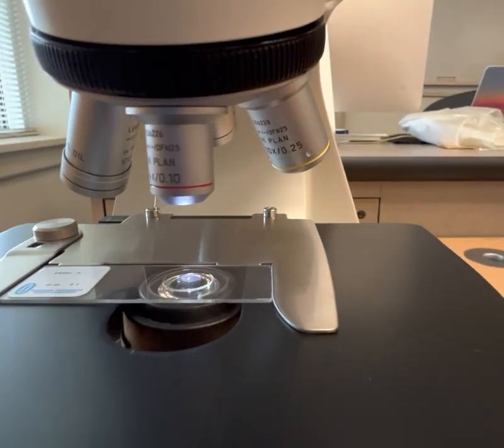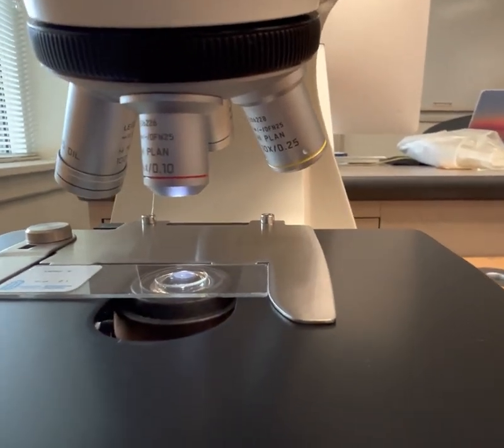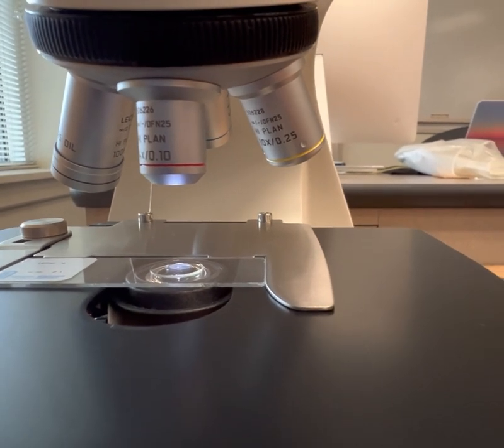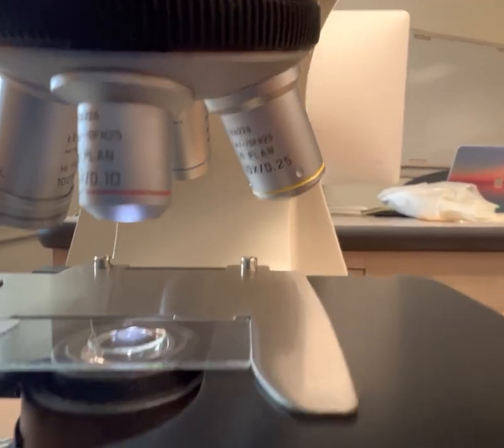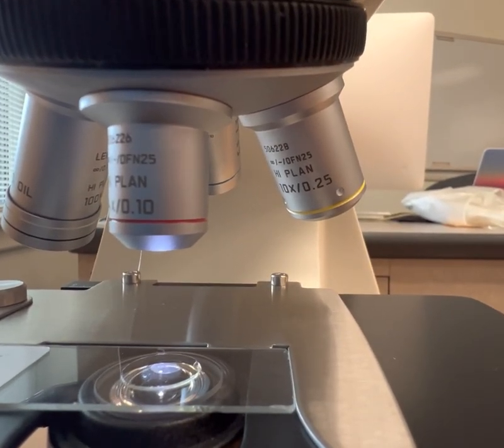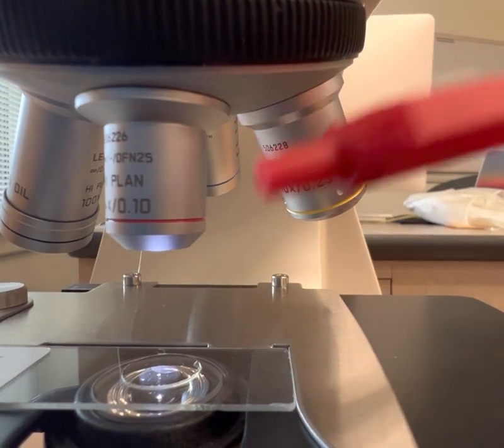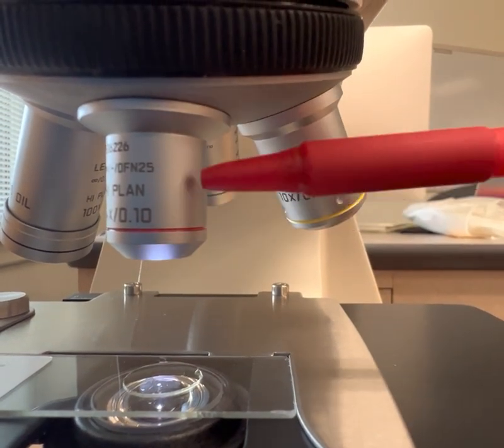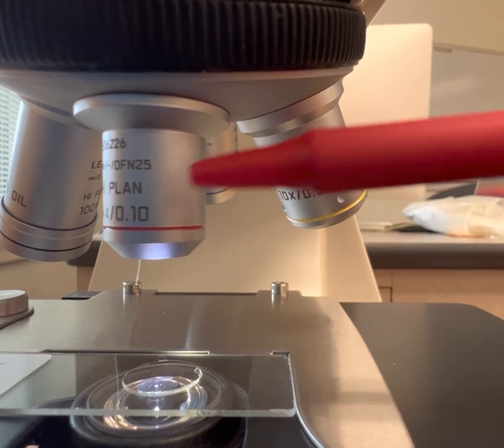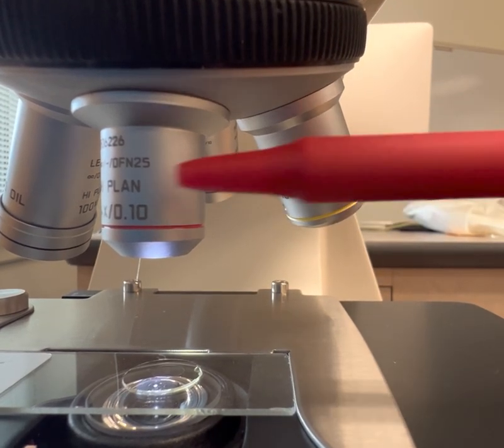When you are looking at them, you're also going to play around with the objectives. Absolutely, you're going to start on the lowest one and go to the best one that you need for your situation. So let me get a little closer. So we're on the mechanical stage, and you can see all four objectives. So I always start off with this guy right here. This is going to be my scanning objective, the scanning power. On our microscopes, they're always colored too, so scanning's always red for us.